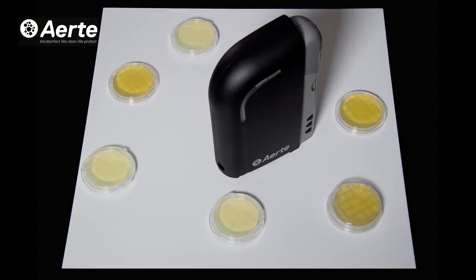In another experiment which we did in-house, we set out to understand the capability of the product to inhibit the growth of bacteria. We included samples from five different individuals, which we put in a liquid solution and then spread on six TSA and SDA plates, and we subjected those plates to the output of the product.